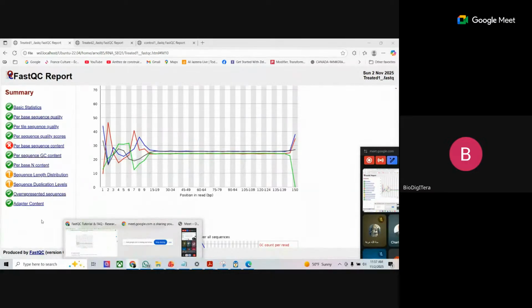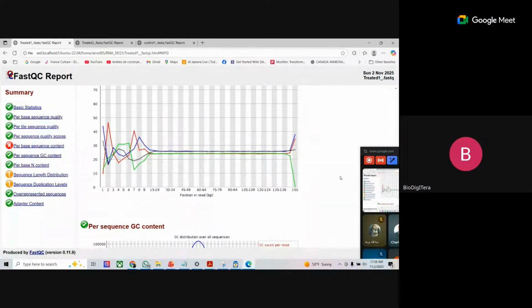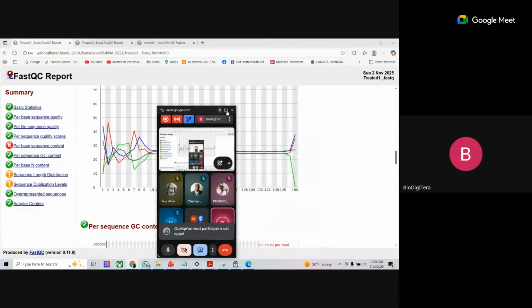If you take time for that, it will be very good. I don't want you just to come here, I want you to take that as an assignment. You give me the analysis for the report of another sample, complete interpretation. And if you don't know the meaning of each, go and look at it on the net. Make your own research. You will understand it better, because we cannot explain everything. Okay, are you okay, guys? If you are with me, I want to see a thumbs up. And we move to what we call trimming.